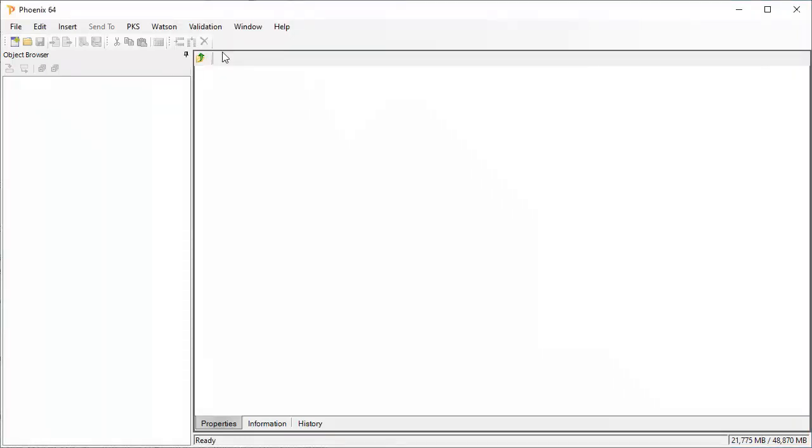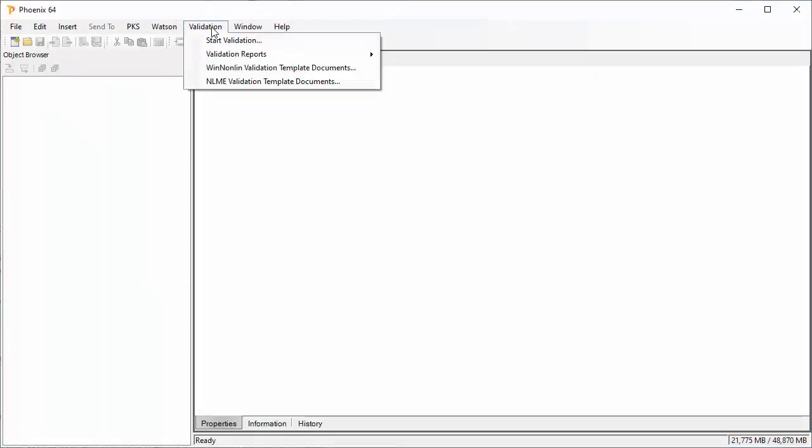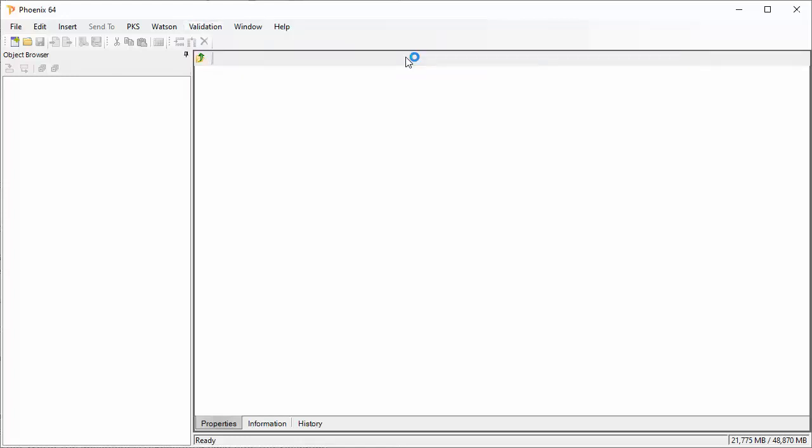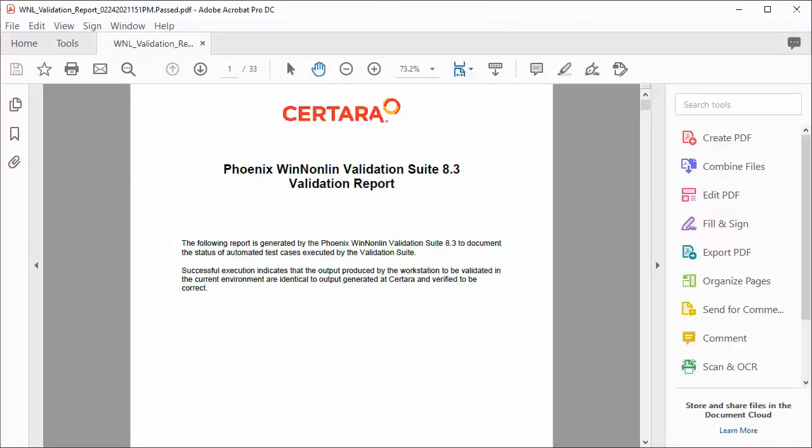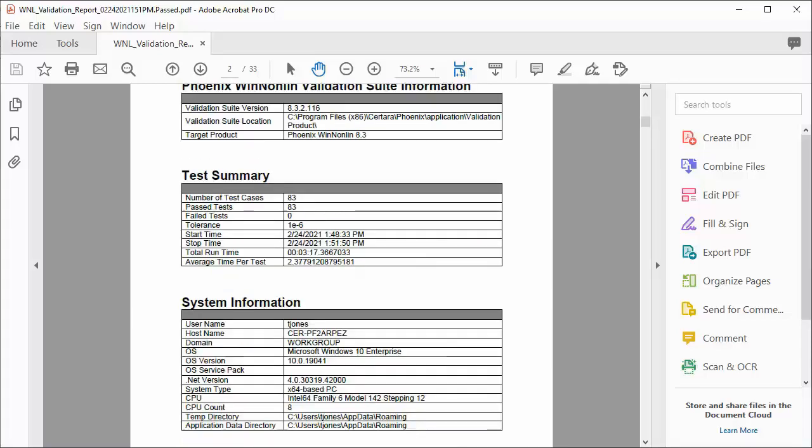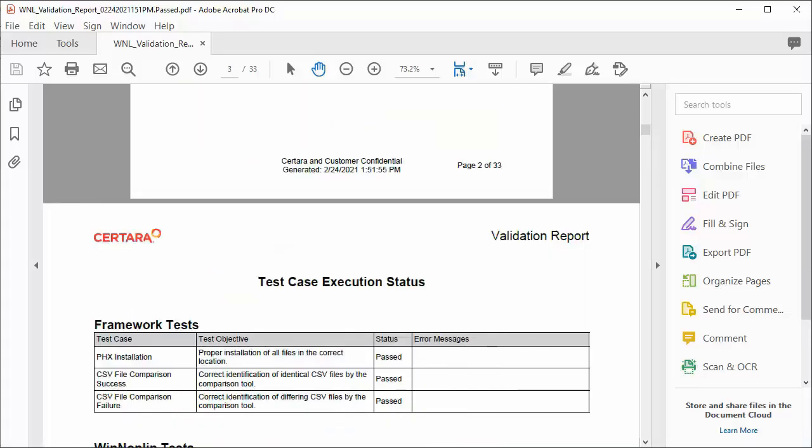We can find the reports that we have executed in the Validation menu. The report is in PDF format, and it lists the results of all the automated test scripts.